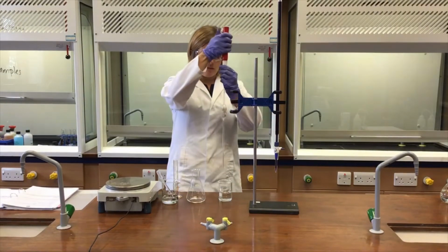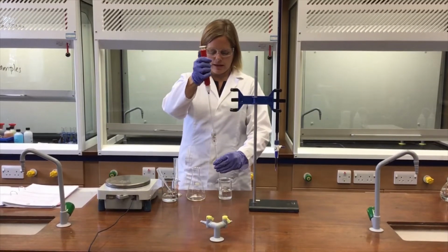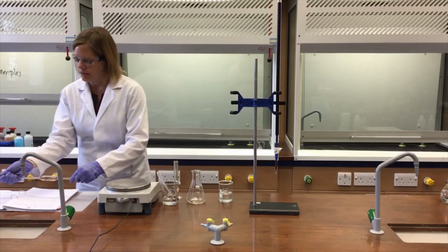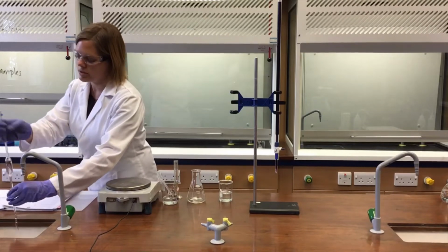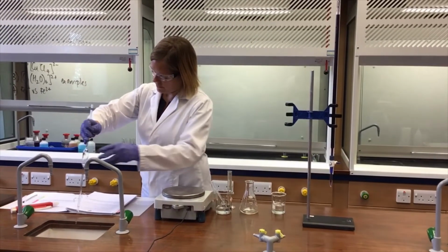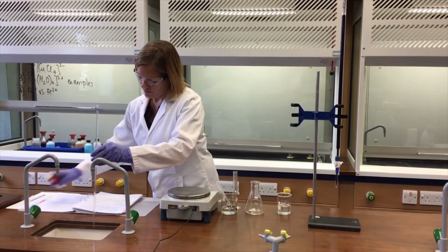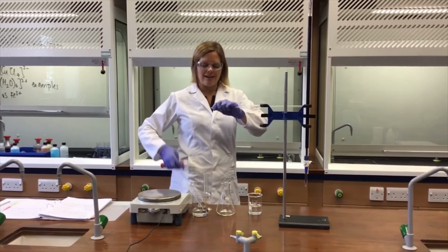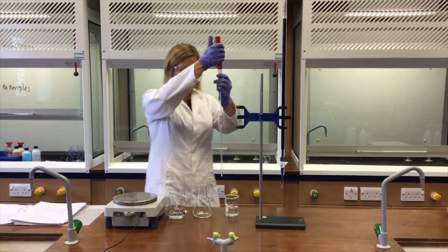I've already added the safety filler to it, so I'm going to just pop that in there. I haven't rinsed it yet, so I'll just take this through and remove that filler carefully, give that a good rinse round with the solution that we're using, and empty down the sink like so. And then pop that safety filler back on, so keeping the hand nice and close to the end of the filler like that. Now notice that I'm wearing gloves for this titration.